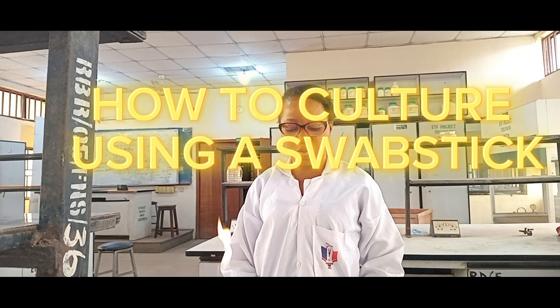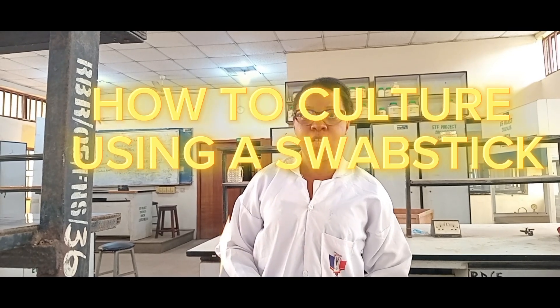Hi everyone, welcome to today's video. Today we'll be looking at how to culture using a swab stick. In a situation where your sample involves a swab stick — maybe you're taking a high vaginal swab, HBS, or wound swab — how do you culture your swab stick on a petri dish? That is what we'll be looking at today. Our sample was taken from a wound.